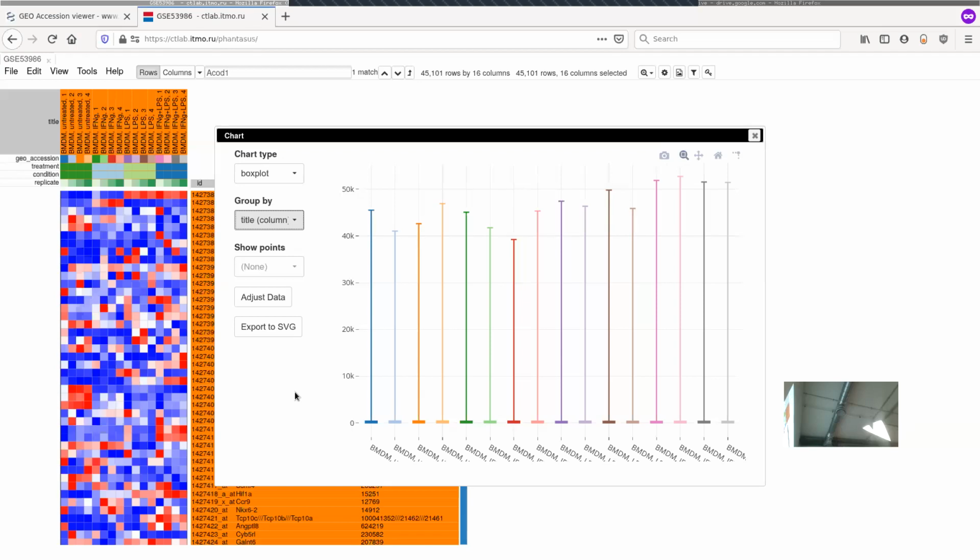And basically what you usually want to look at is differential regulation, or when you see some changes. And for these changes, you look not just at changing from A by some number. What you usually are really looking for is proportional change. So this protein got a twofold upregulation, or fourfold, or tenfold. You don't deal with absolute changes; you want proportional changes.